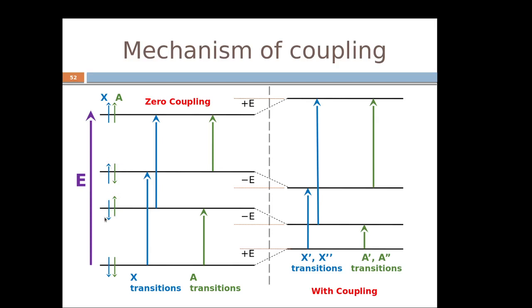Both these nuclear spin configurations are equally probable, and they should have the same energy. They should be degenerate, but for argument's sake, we slightly shift the energy scale here in order to see how the transitions happen in our energy level diagram.